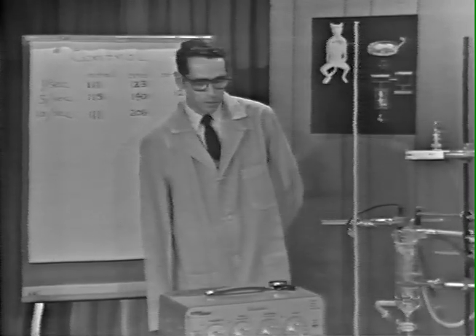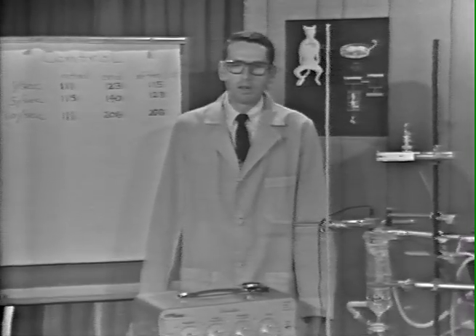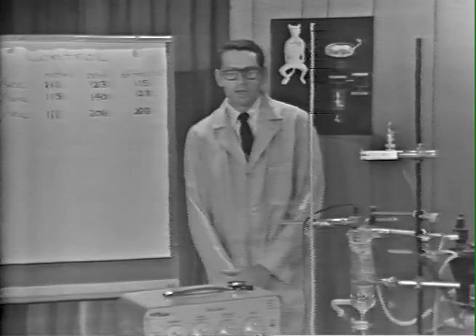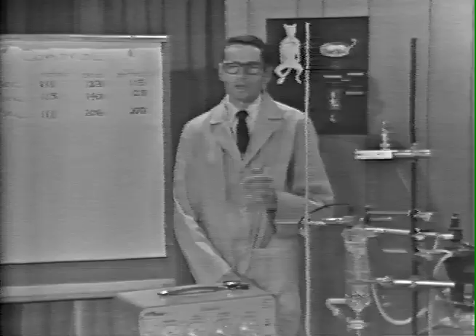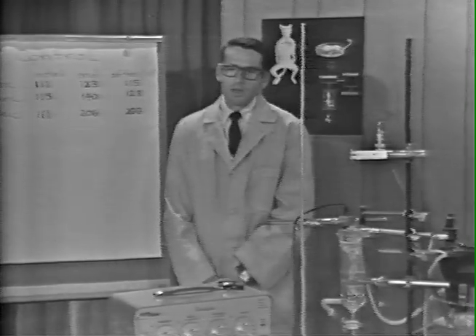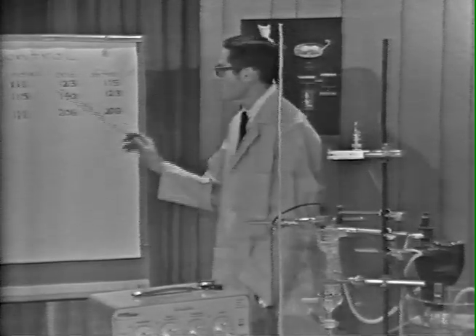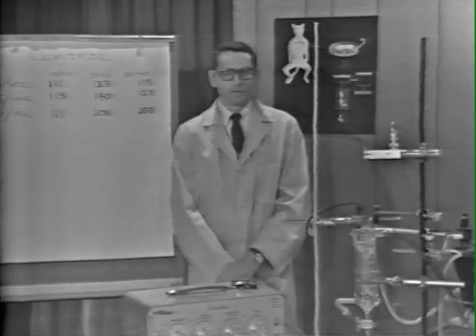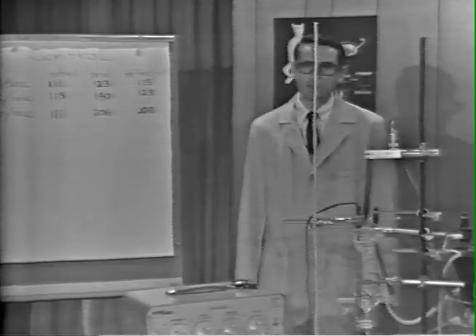Now we are going to proceed with the experiment and place cocaine in the bathing media. We are going to put cocaine in the Krebs solution reservoir and expose the preparation to this drug so that from this point on, the preparation will be exposed to cocaine continuously. We will wait about 30 minutes and then obtain responses at these same stimulation frequencies again and compare the responses to those obtained before cocaine. We can then come back to the preparation in about 30 minutes.